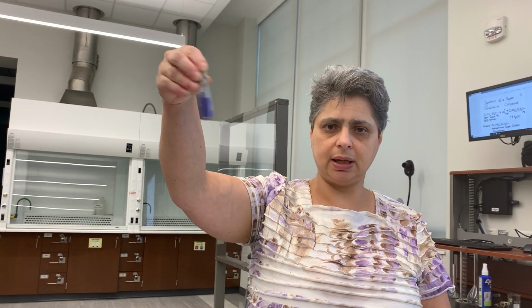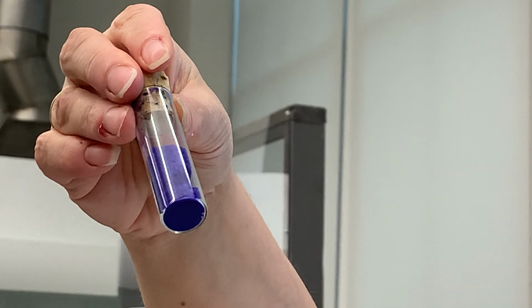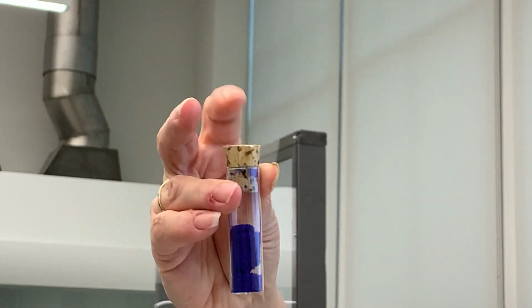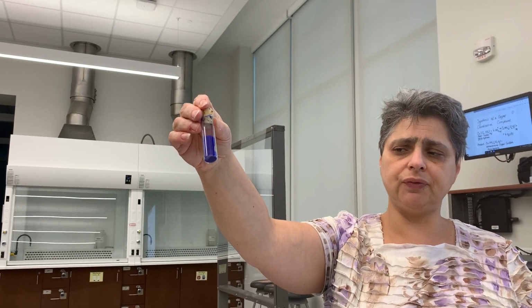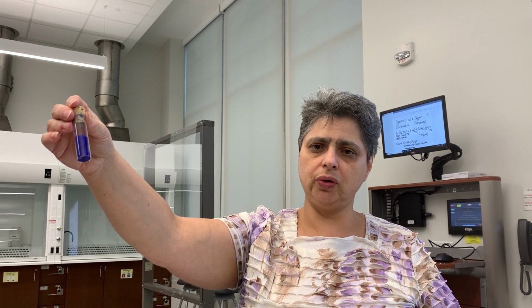So this compound is a purple solid. I have some from a previous semester here in the vial so you can see what it should look like when you're done. Each of you will be provided with a glass vial with a cork stopper like you're seeing here, and you'll be able to make this compound, and after drying it on a paper towel, you're going to place it in this vial and put it in your drawer for the following week when you will actually analyze it.